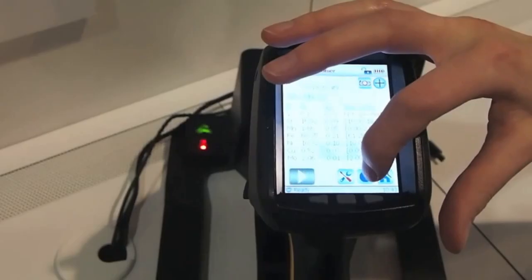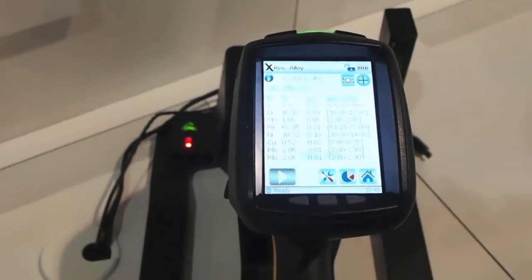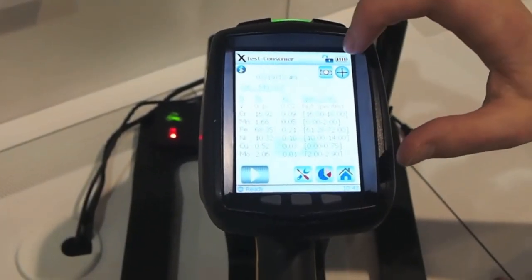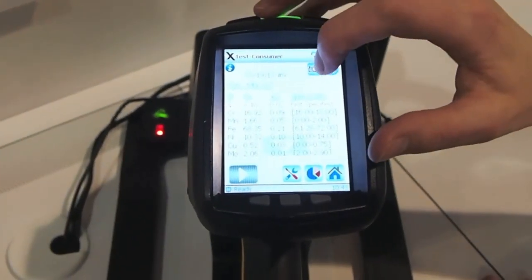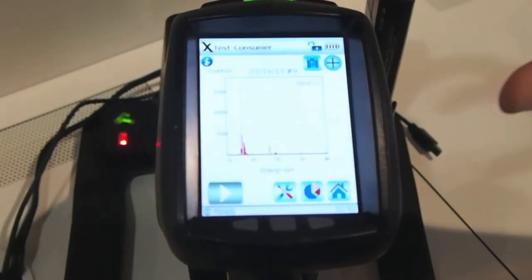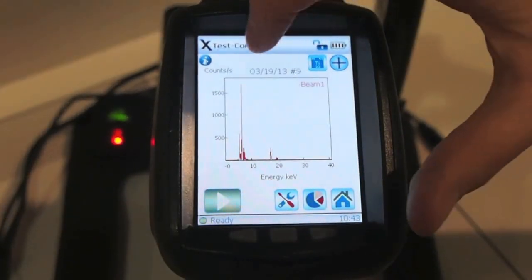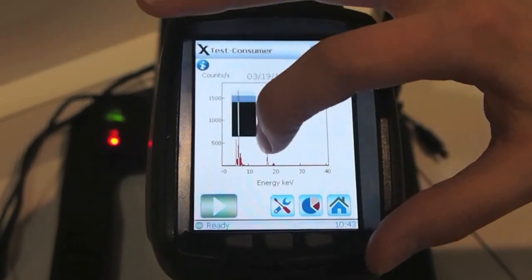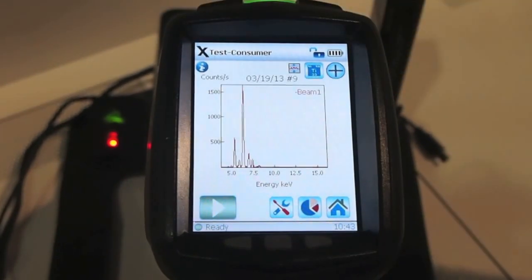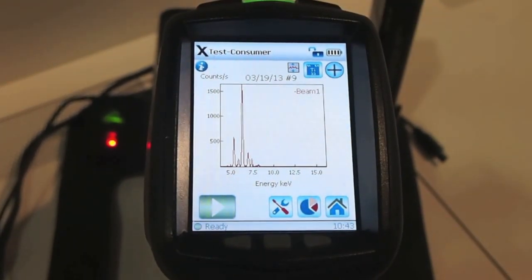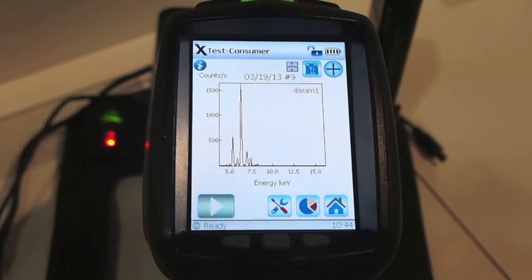In our results we're able to look at both the chemistry as well as the spectral data. This is helpful because you can zoom in and look at the peaks for the different elements that you're most interested in.